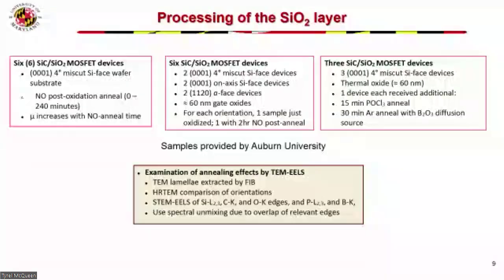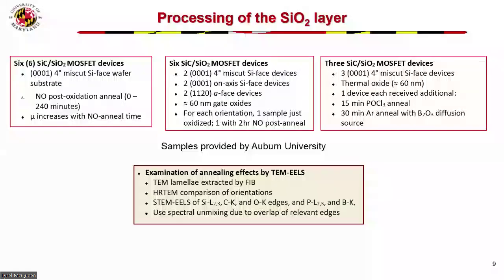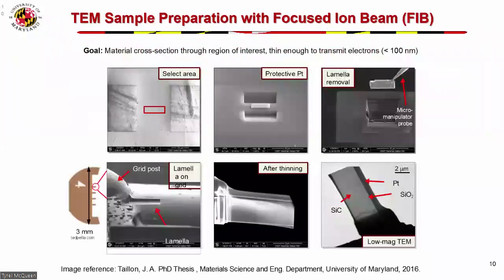And we use spectral unmixing using HyperSpy, which is a machine learning algorithm designed to analyze EDS or EELS data in the TEM.